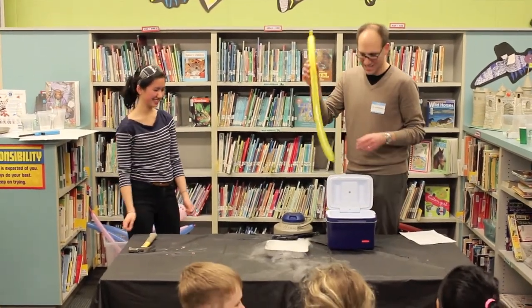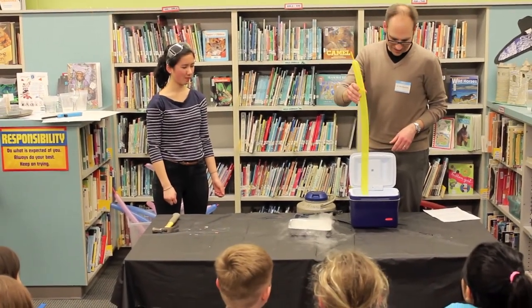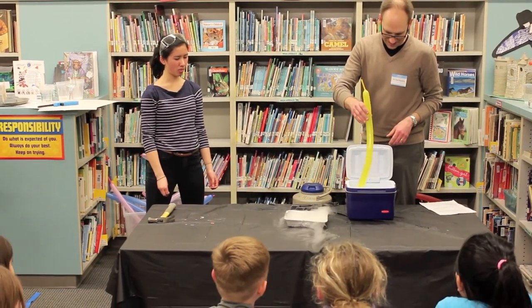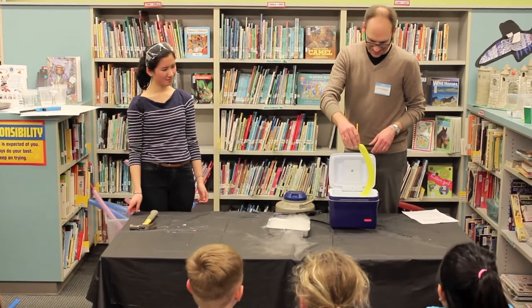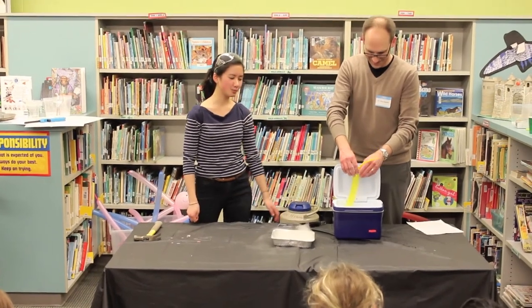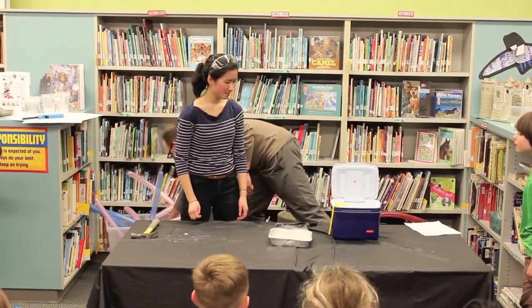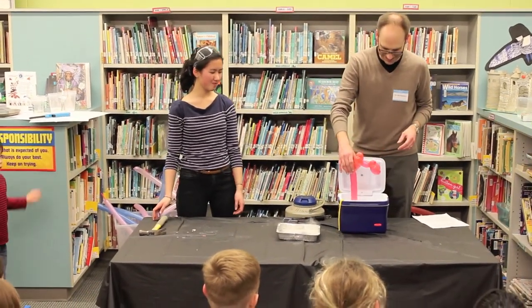He does the experiment. Okay, now standard balloon. I'm going to feed it here to the liquid nitrogen that we have in this vat. This vat hasn't eaten in days, so it's really hungry for balloons. Maybe we should get another one too. Sit down, bug. Maybe one of these animals. Sit down, bug.